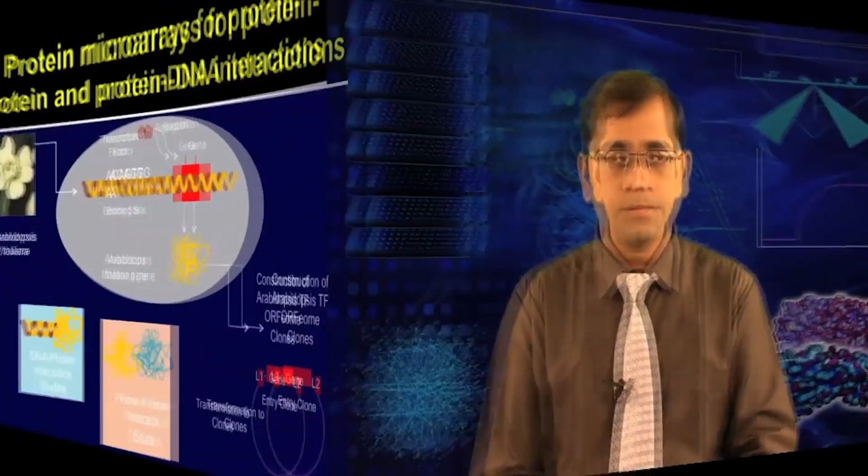Let us discuss the first case study of this lecture. The development of protein microarrays and their applications in DNA to protein and protein-protein interactions, analysis of Arabidopsis transcription factors is a study performed by Gong et al. The transcription factors play a very crucial role in cellular and developmental processes in organisms, including plants.